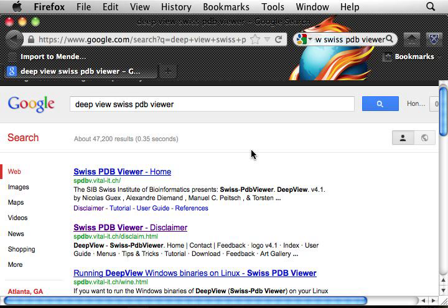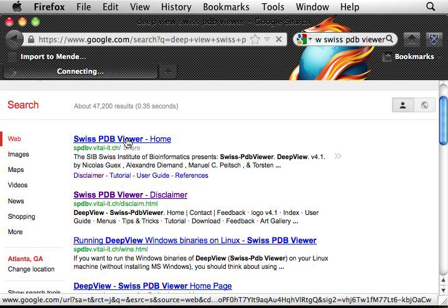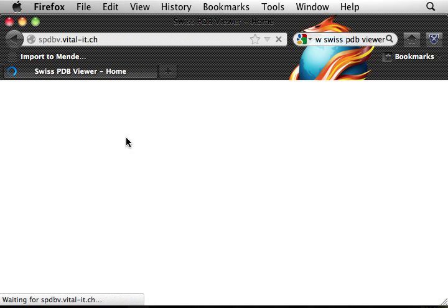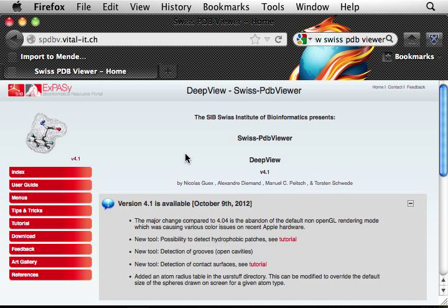Yes. So that's Swiss PDB Viewer. And that's our main page.